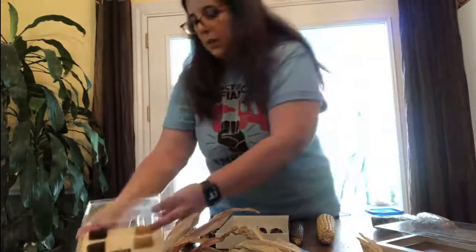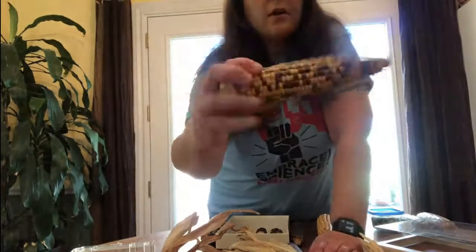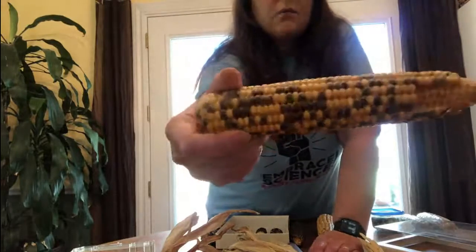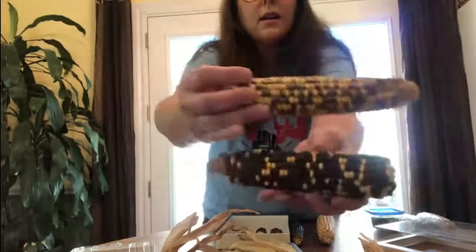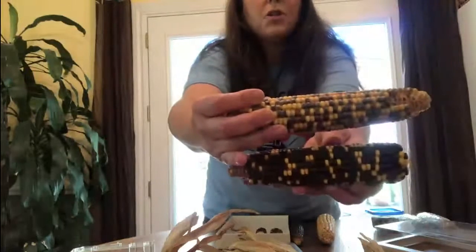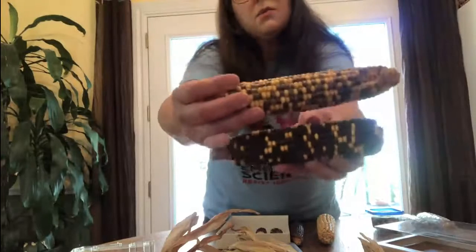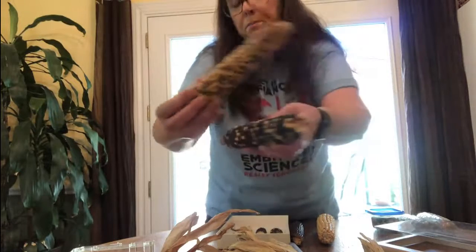And so that cob would look more like this cob, although this is a really old cob. You can see that it has a more equal distribution of yellow and red in comparison to the monohybrid cross with a 3-to-1 ratio. So this is what we're actually testing for when we are counting our offspring.